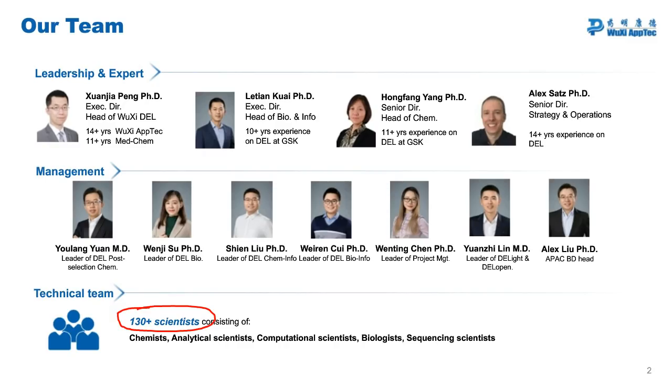How do you do screening for proteins that are difficult to purify? Oh, well, an excellent question. In order for the DEL screen to work well, the protein quality is very important. And I would have to say that if the protein can't be purified and if the quality can't be high, then the chances of the screen working well are much lower. I can't guarantee that the screen won't work, and I can't guarantee that it would work, but the better your protein is, the better the outcome of the screen is likely to be.